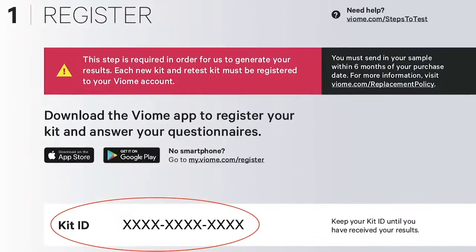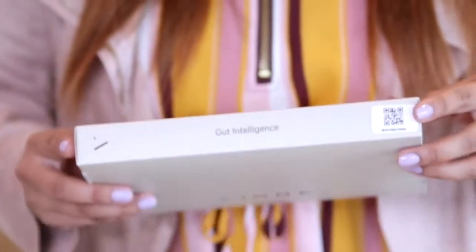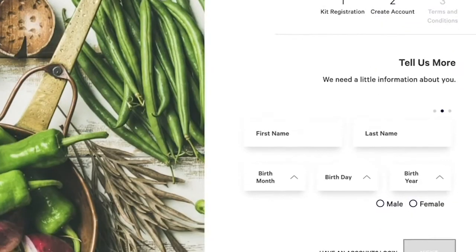Your kit has a few different codes associated with it. You can use any of these codes to register your kit. Be sure to write down at least one for future reference. If other household members are also using a kit, please be careful not to mix up your materials because they are specifically linked together. Your test kit is unique to you.